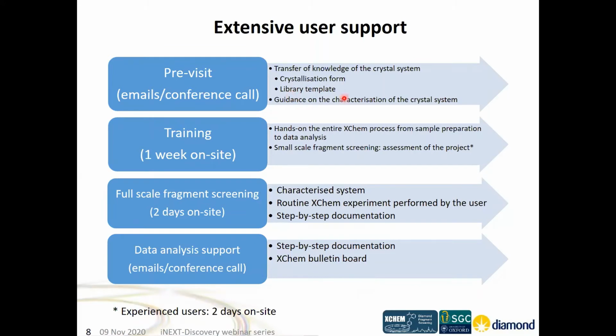You also can get a library template. If you want to ship us your compounds, we would want it in a certain format, and we need then the plate map for that library.